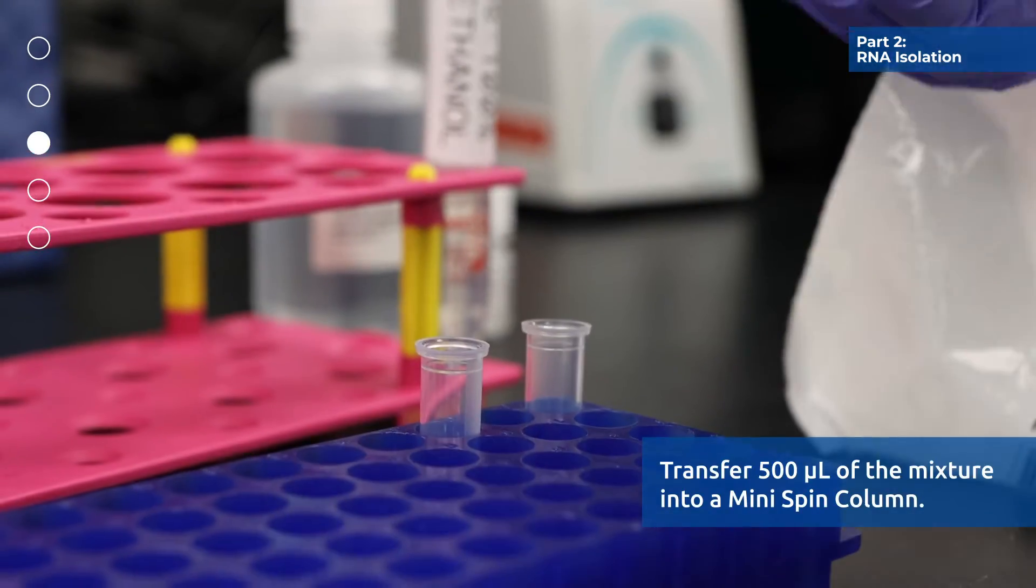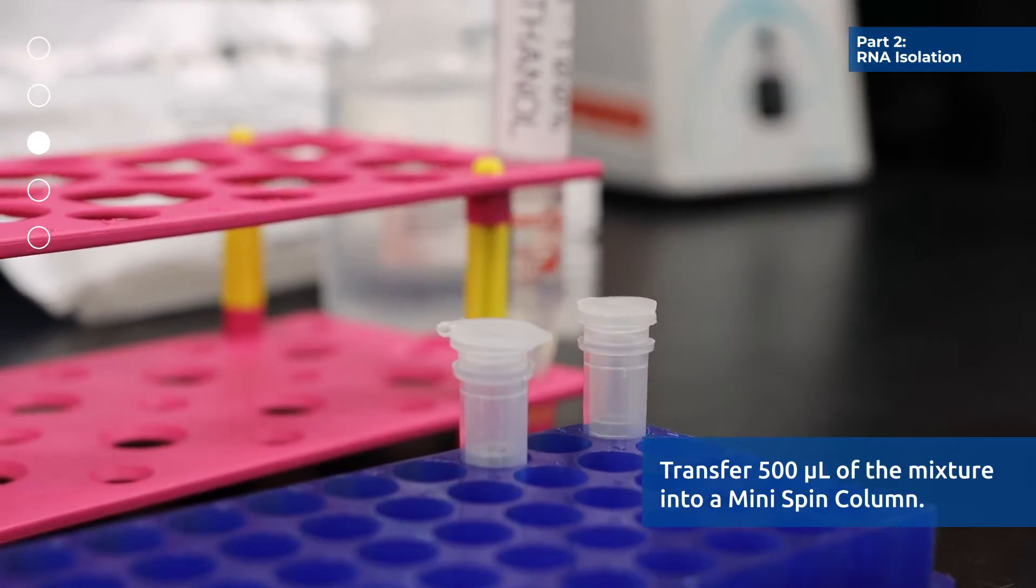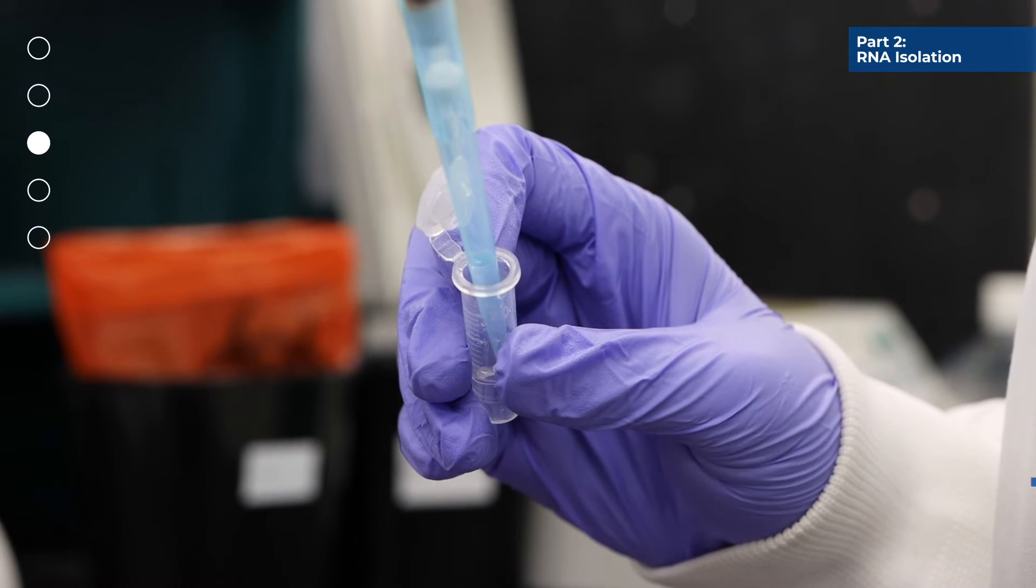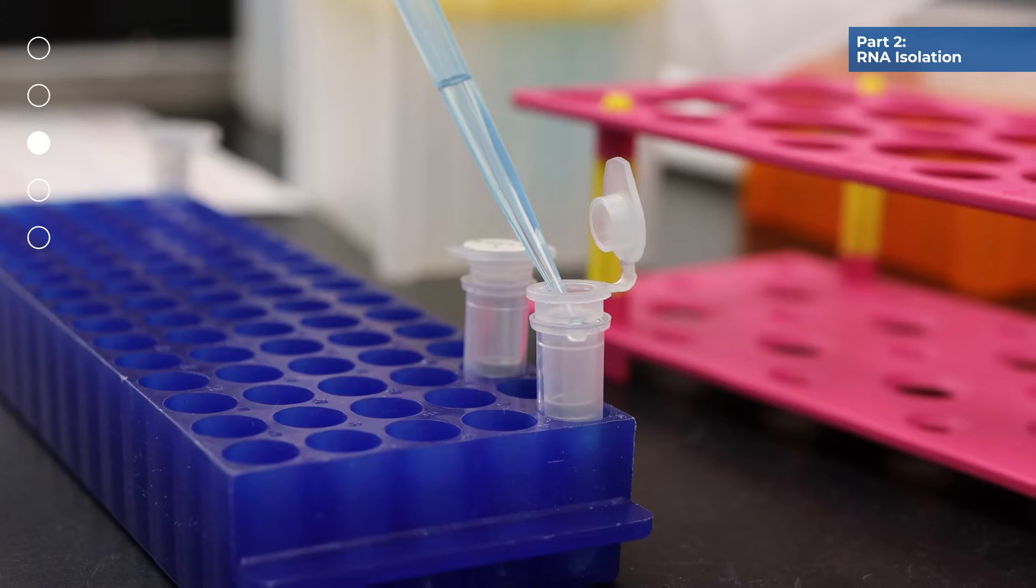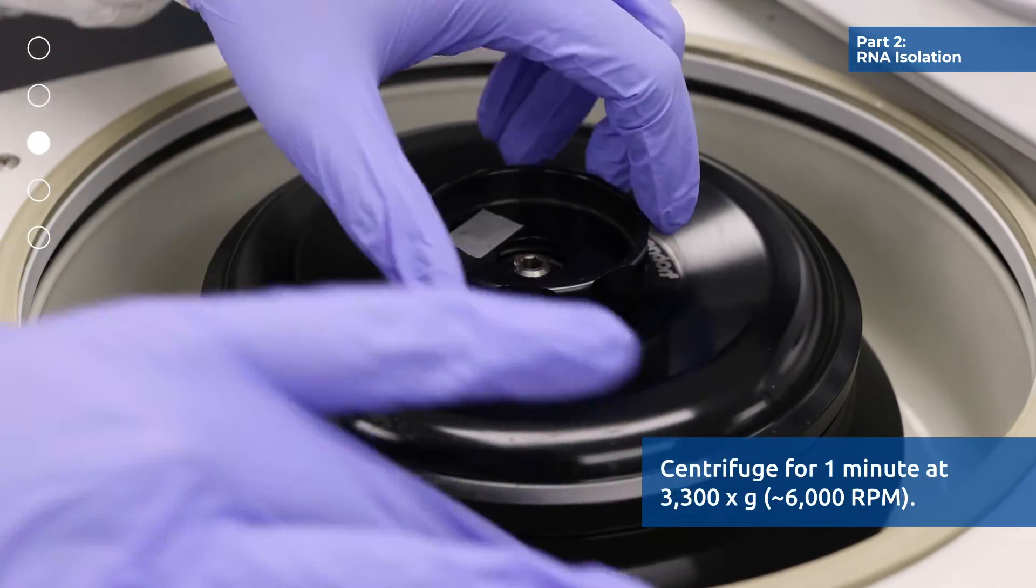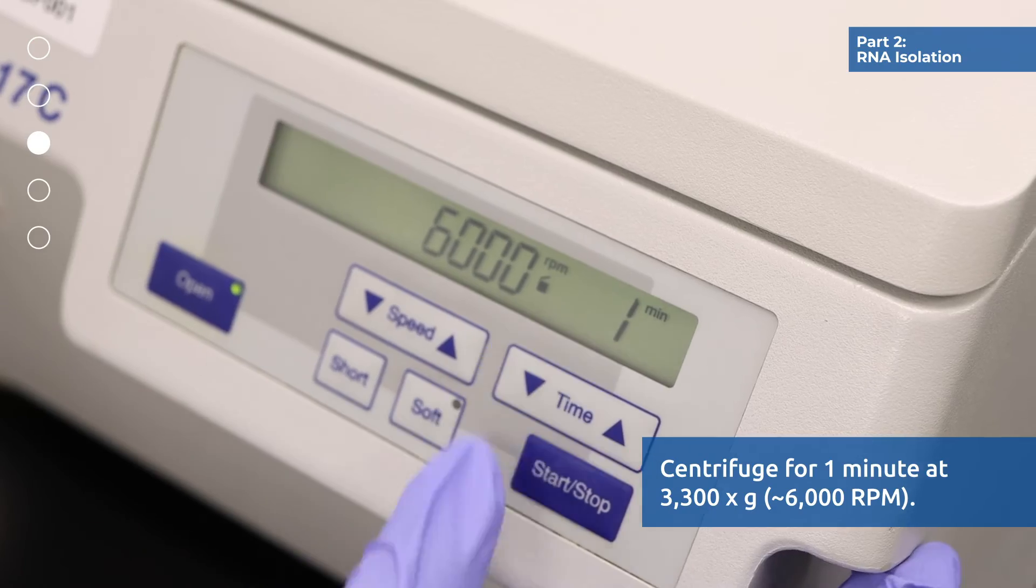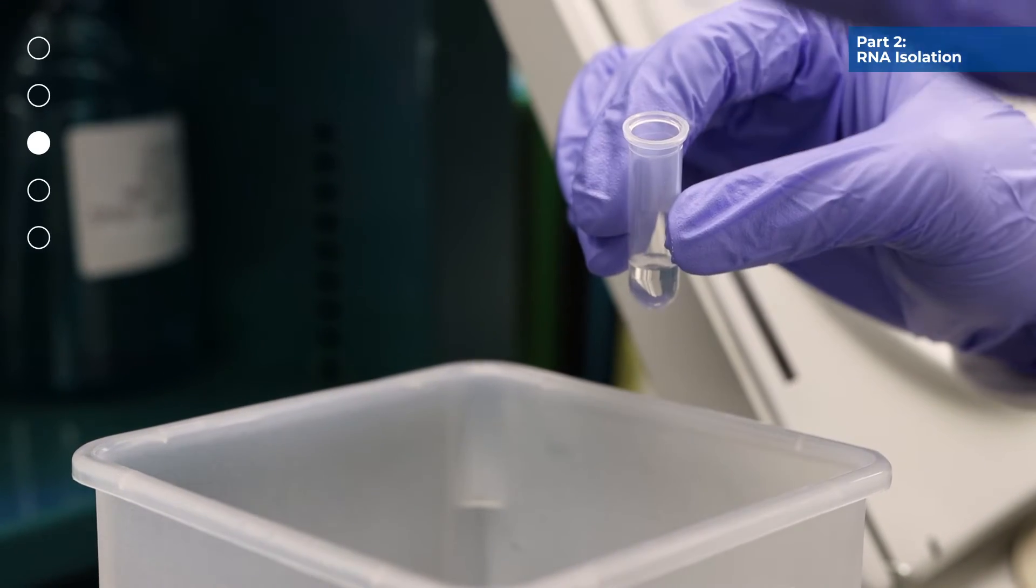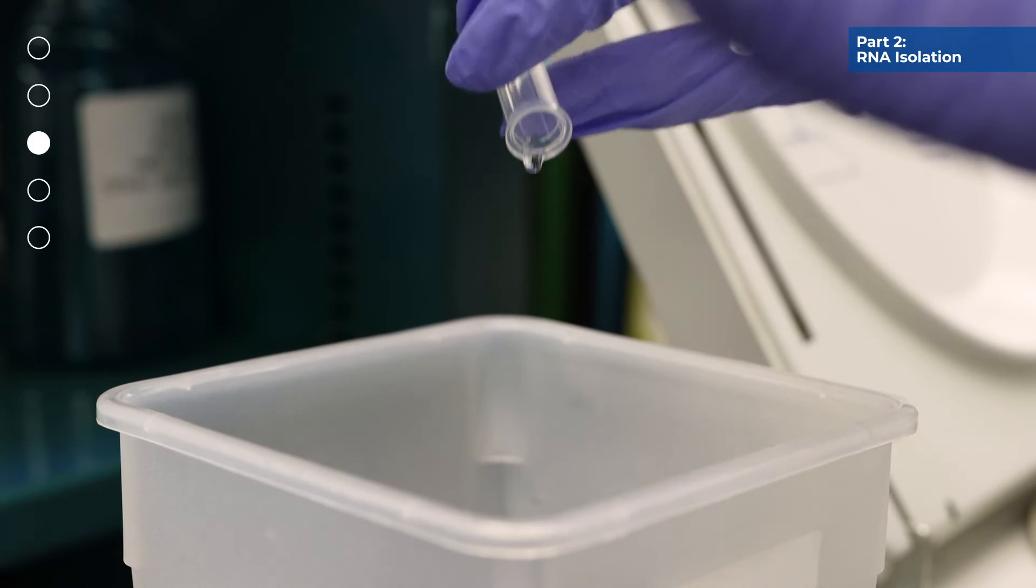Transfer 500 microliters of the mixture from step 3 into a mini-spin column. Centrifuge for 1 minute at 3300 g or 6000 rpm. Discard the flow-through and reassemble the spin column with its collection tube.